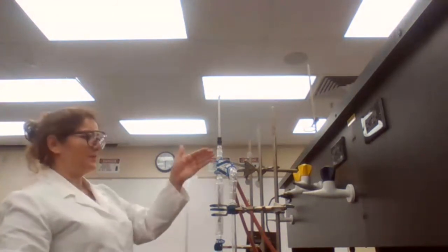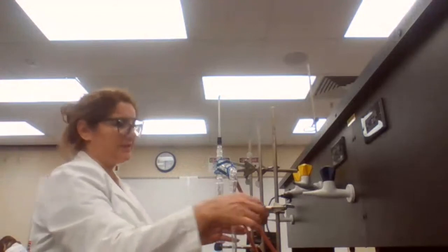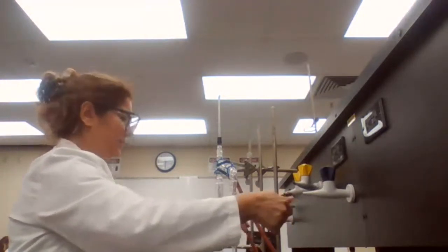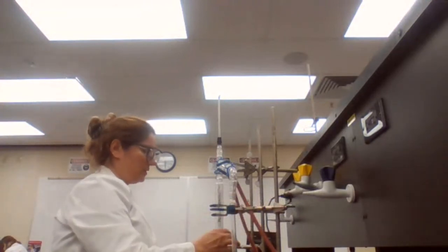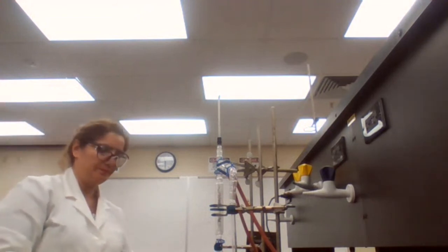Sometimes we have to wrap it with aluminum foil, but I wait first, and if it happens within the 5 minutes, based on the boiling point of the compound, I'm fine with it, and I would just continue without the aluminum foil.